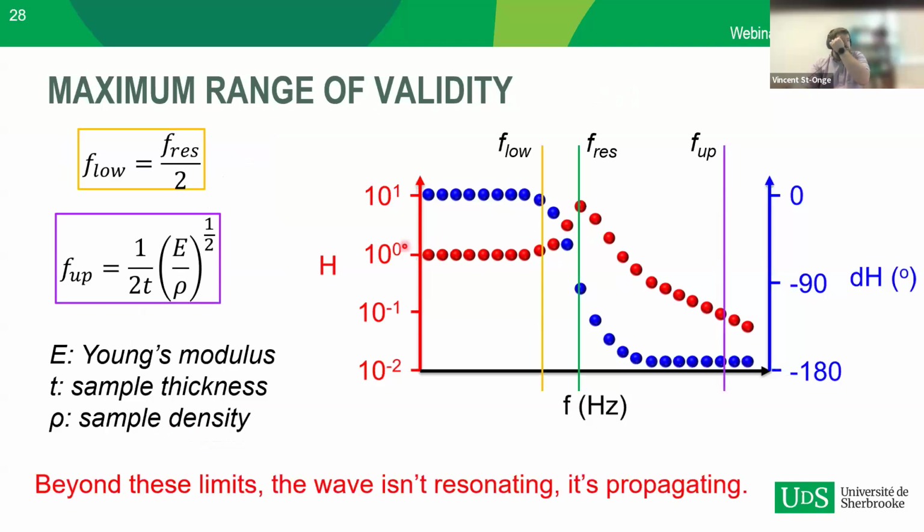And then you can also define two additional frequencies, which are very important: the lower limit of validity of the model and the upper limit. The lower limit is given by dividing the resonant frequency by 2, and the upper limit is very often not anywhere close. It's very often higher than 10,000 hertz. So with the VHF 10.4, it's not a problem. We'll always have something good up to 10,000 hertz. But if you want to go from 100 hertz to 10,000, that means you need to tune your resonant frequency to 200 hertz in order to have the lower limit at 100.